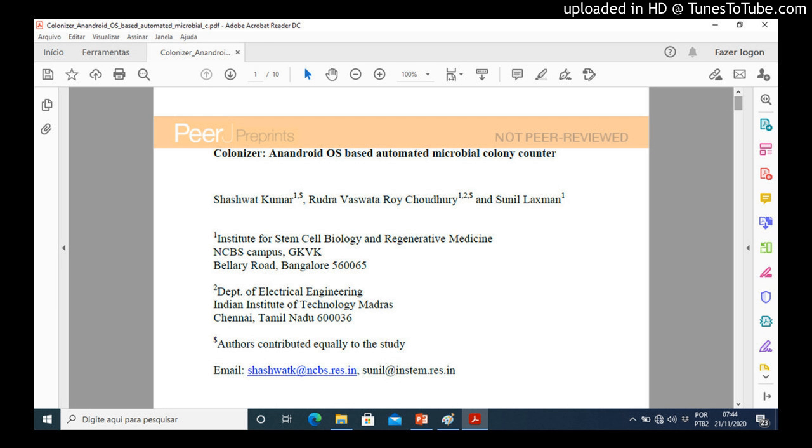Outlier and noise removal. This step involves removing artifacts and noise present in the images by detecting contours. We remove potentially noisy contours by filtering out the ones having an area less than 12 pixel units, applying distance transform and finding the regional maxima.